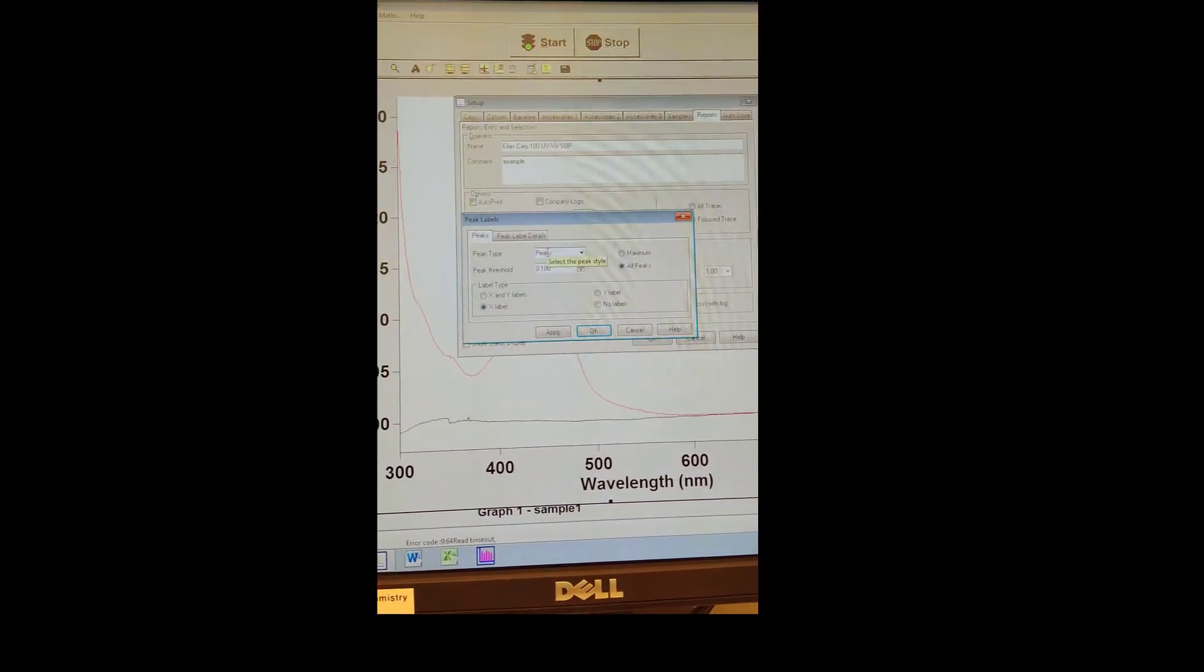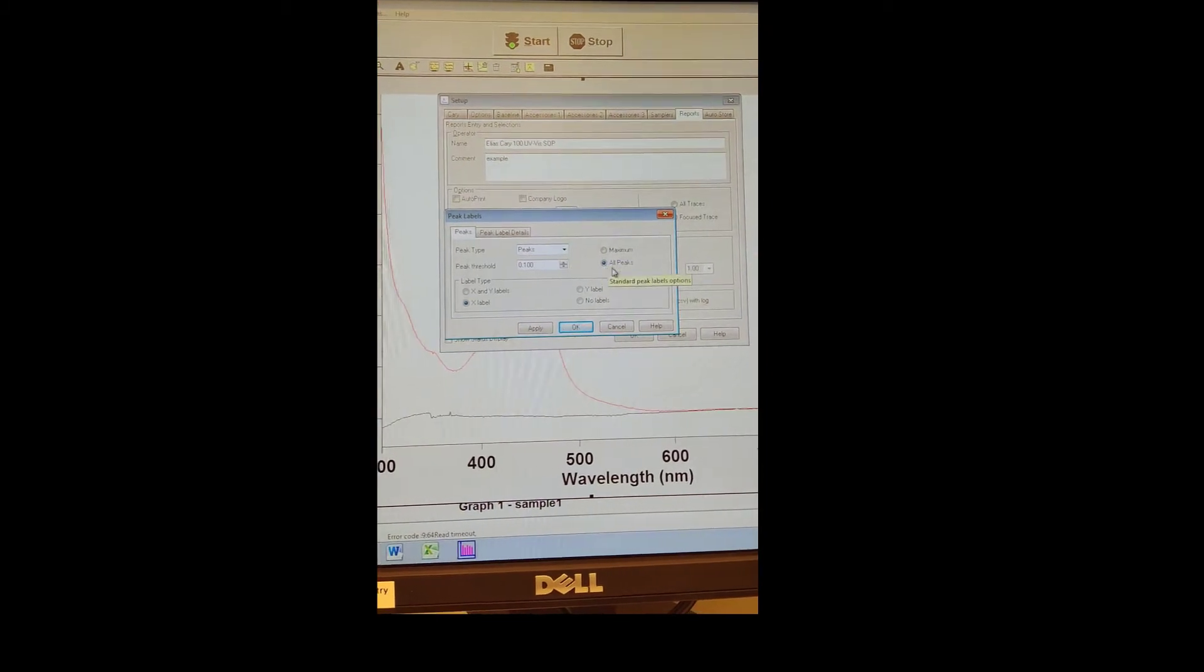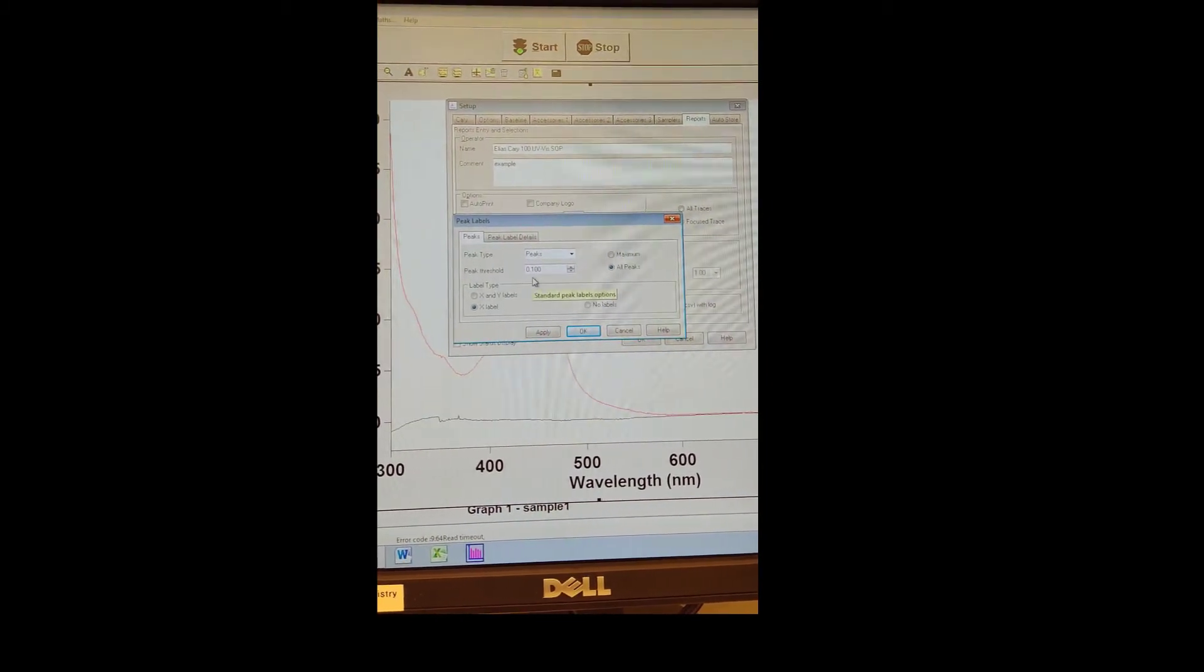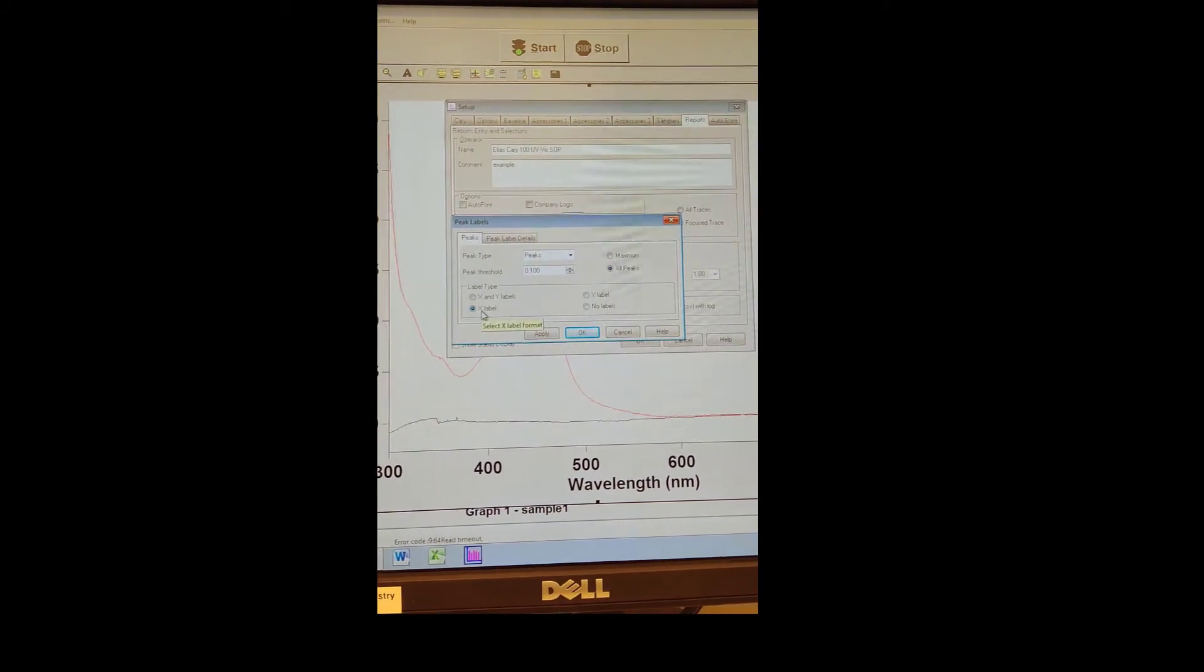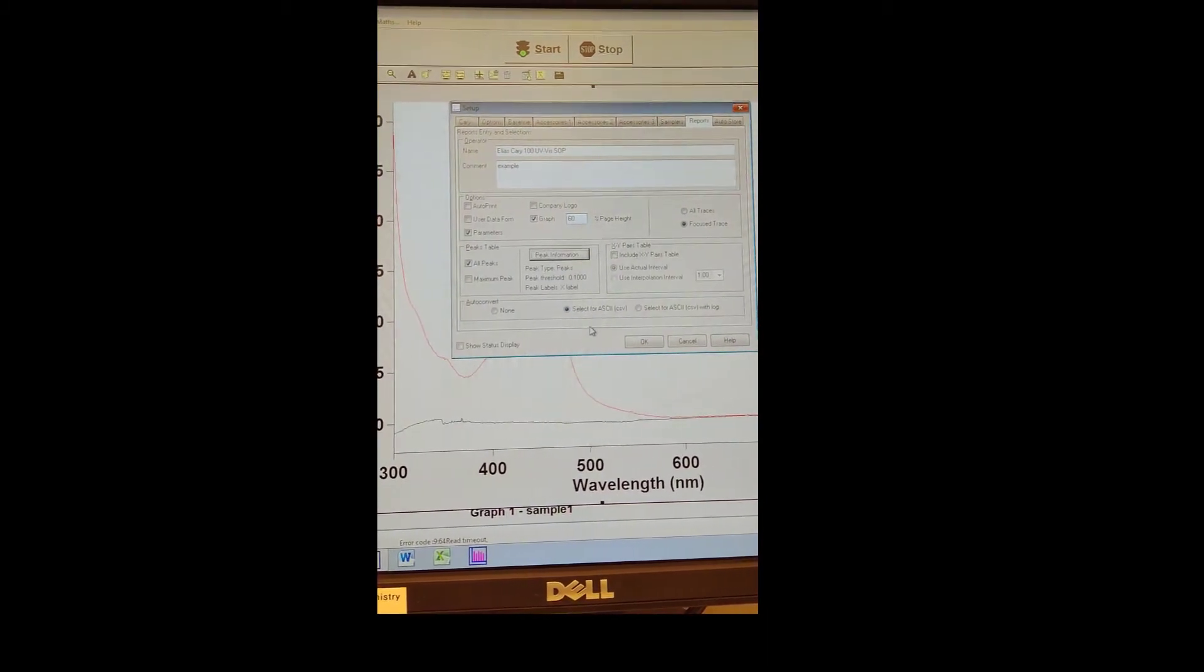Make sure Peak Types is all peaks. Go to Peak Information, Peak Type is peaks, all peaks, and Peak Threshold should be 0.1. Select X Label, or you could also select X and Y labels if you think that's easier.